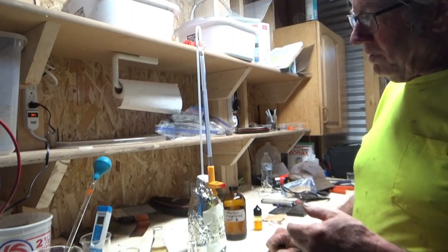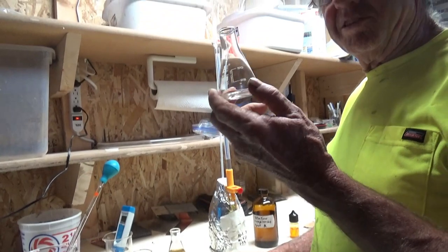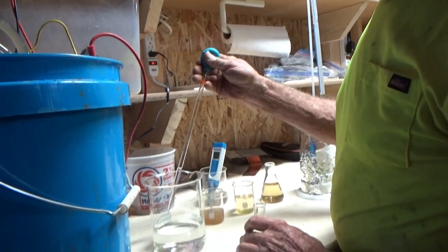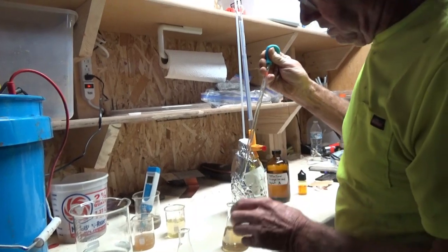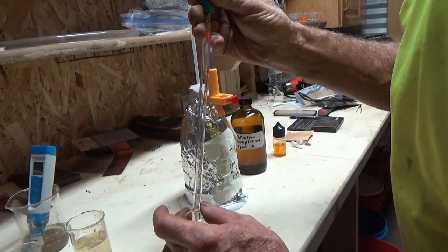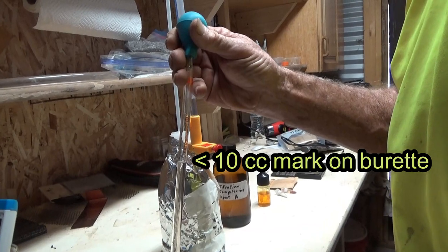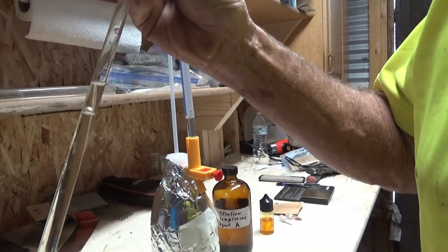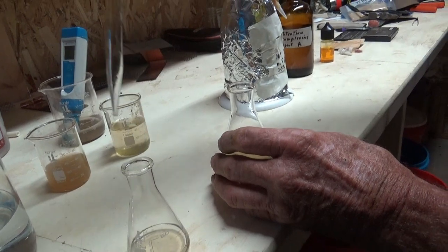And you're going to need a couple of pieces of labware. Now, first thing you're going to need is something to do the test in. A little 50 mil flask works well. For this test, it's calibrated for 10 cc's of solution. So you take, and this is called a burette, and you draw 10 cc's of solution and put it in the flask.